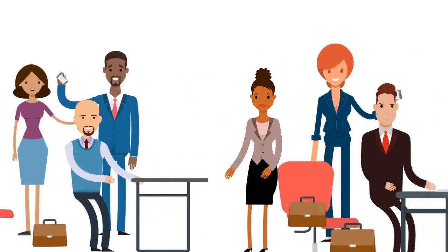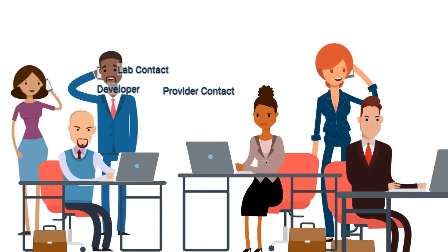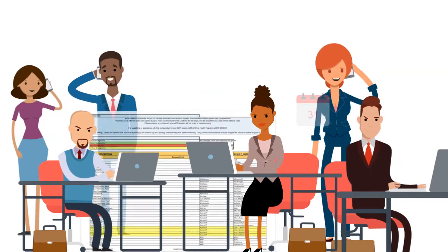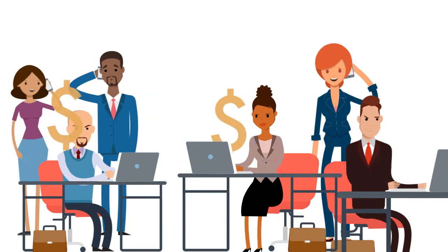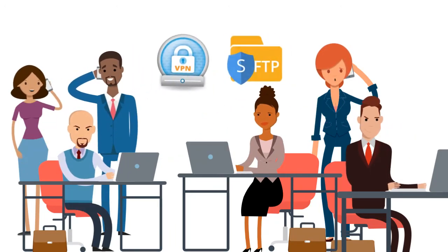During the discovery call, initial housekeeping is completed. It's during this call that key players are identified, recurring meetings are scheduled, and specifications are traded. Managed by the interface team, project details such as budgets and timeframes are established, and it's decided how connections to the different systems will be made.